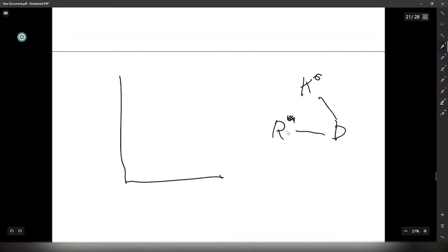So all of these interact. K0 is inversely proportional to RU, D is inversely proportional to RU. And what ends up happening is you end up having 3 parameters interacting with each other so that you can never really optimize to a good fit. You'll always get really weird values of your parameters. Again, the best way to do this is probably just to set RU, but if you had a different parameter there, you would just set the easiest one, or the one that makes the most sense chemically to set, you would set that. And that works really well.